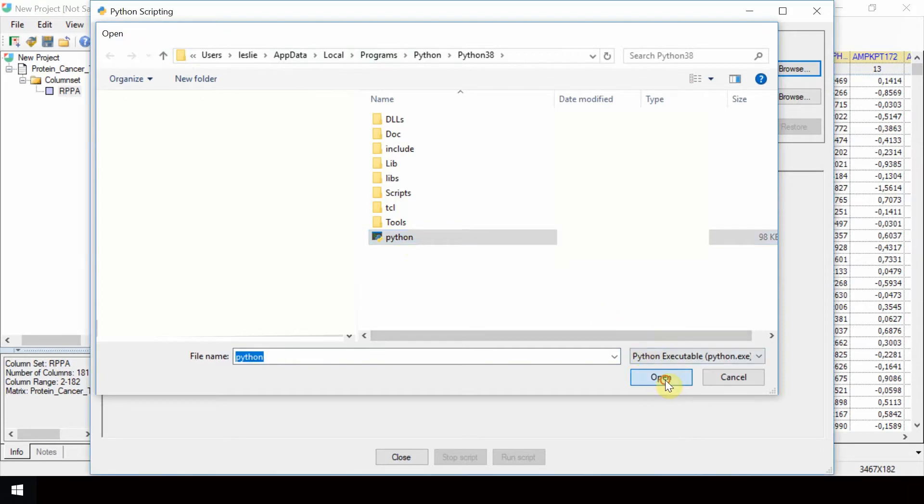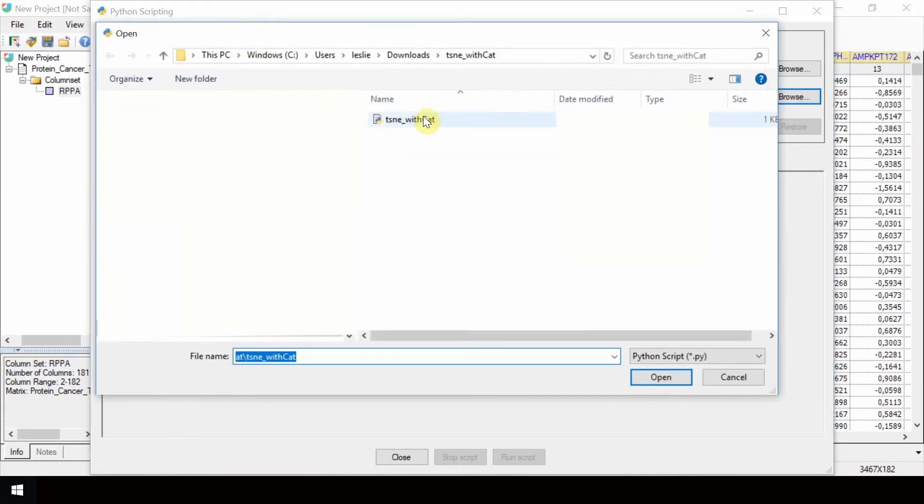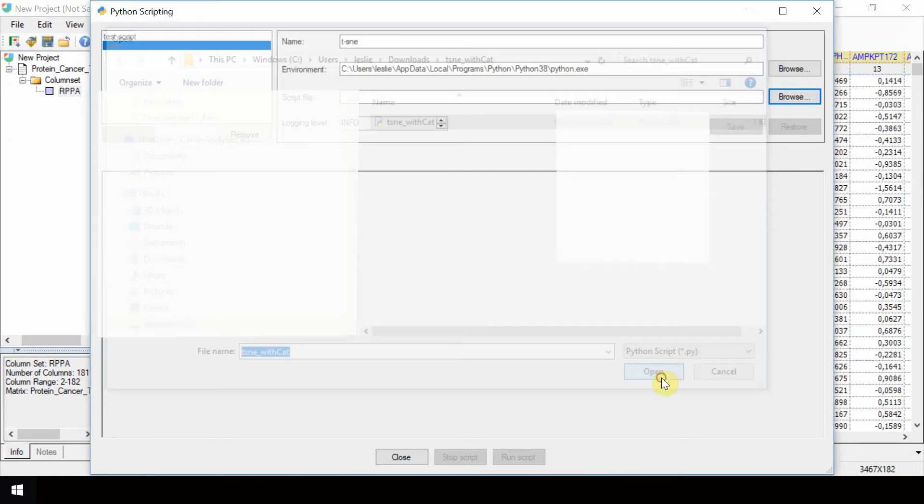Click Open. For the script file, browse to the location of the downloaded tsne_withCat.py script and select it. Click Open.